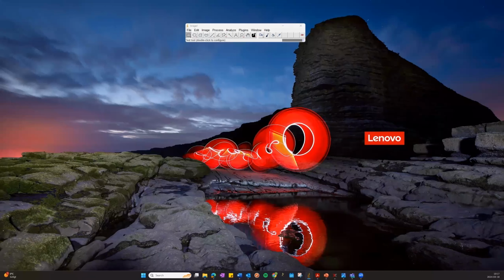The second step is to perform the deconvolution of the raw TIFFs from each fluorescent channel against their respective theoretical PSF that we just generated. So this section outlines the process for performing 2D deconvolution. That is deconvolution on a single image focal plane, so a single Z slice. If you have acquired 3D Z stacks, it is important to perform individual 2D deconvolution on each Z slice so that they can be analyzed separately in CellProfiler later on.